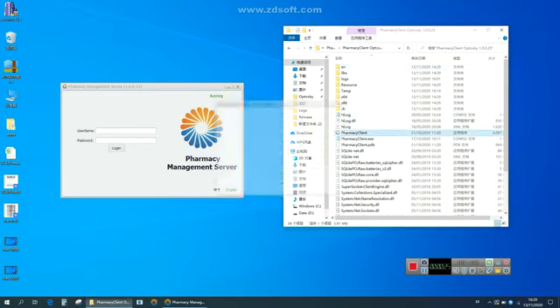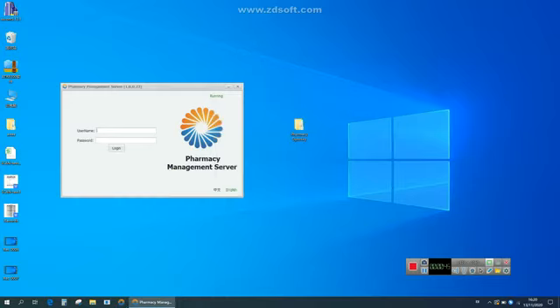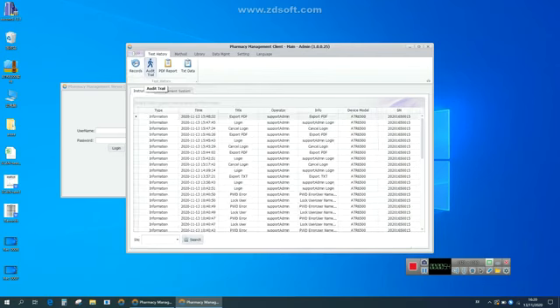Here you can see the audit trail. Yeah, all this is audit trail. You can see the instrument audit trail and management audit trail systems displayed separately. After reviewing the audit trail, you can select all events for report. That's the end of the list.